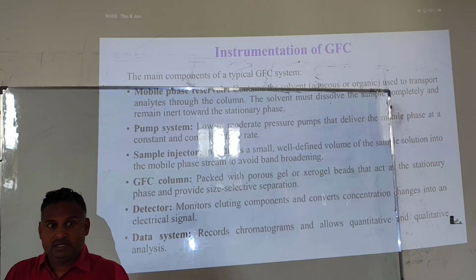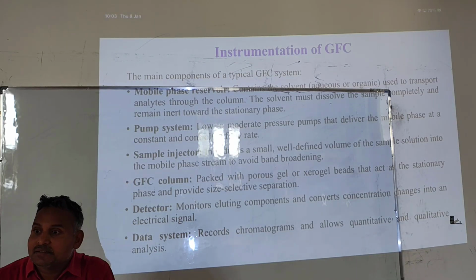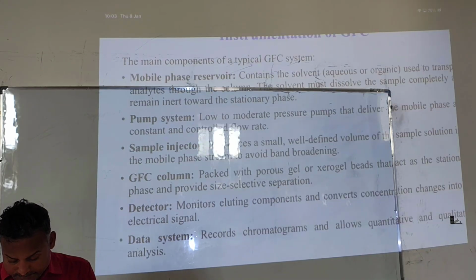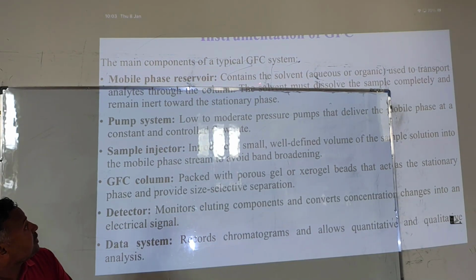But inside the column, the stationary phase packing will be different. Is it clear? Mobile phase reservoir contains solvent that is used to transport analytes through the column.